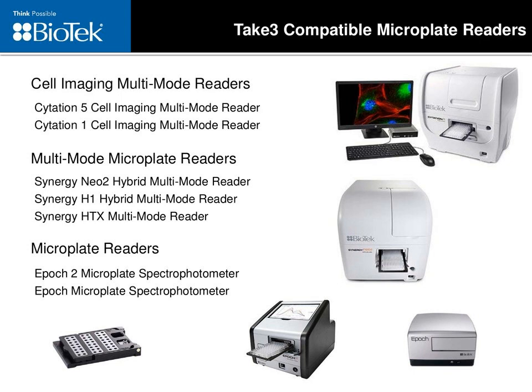These include the Cytation line of imaging instruments, including the Cytation 1, 5, and the Synergy line, including the HTS, Neo2, H1, and HTX multi-mode readers, as well as the Epoch and Epoch 2 absorbance spectrophotometers.